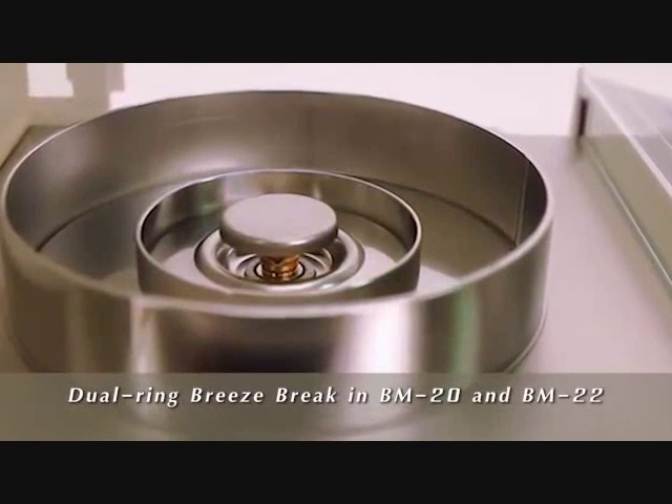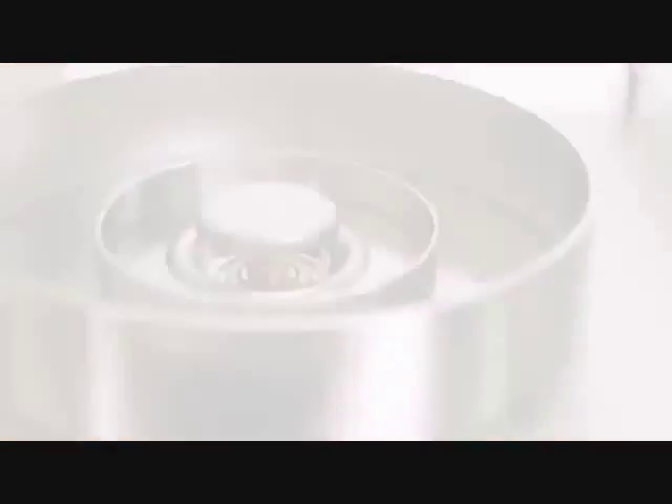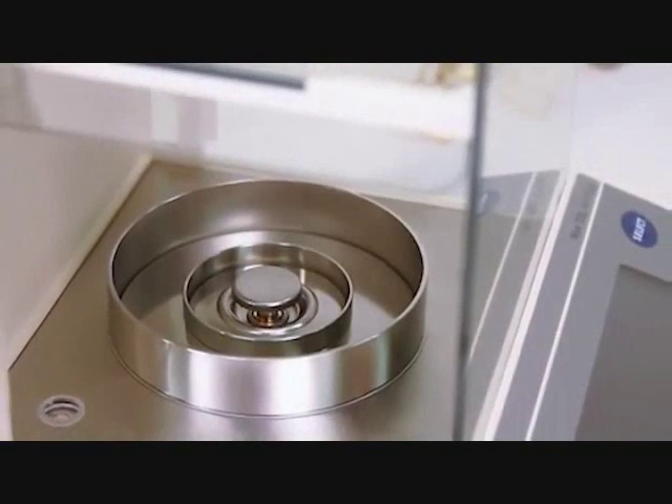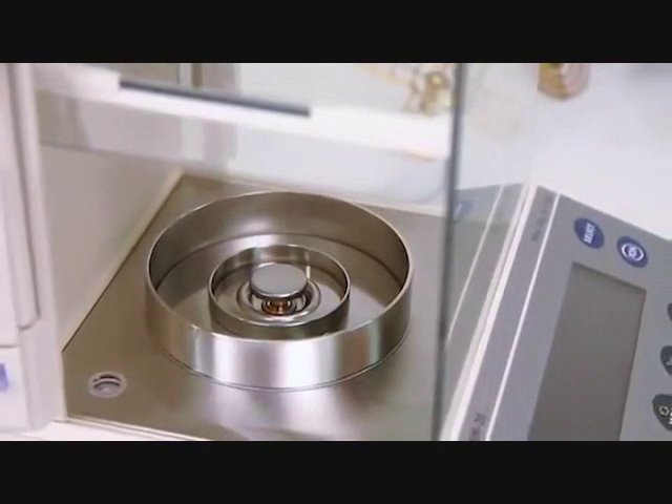The innovative dual-ring breeze break reduces drafts in the BM20 and BM22 microbalances. This feature makes a secondary inner chamber unnecessary to achieve microgram readability.